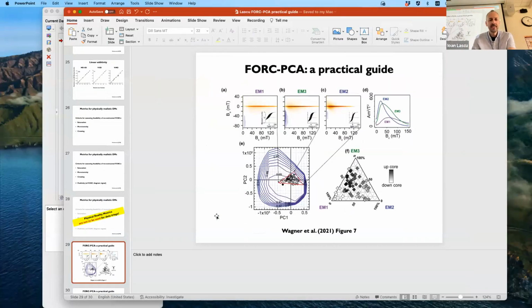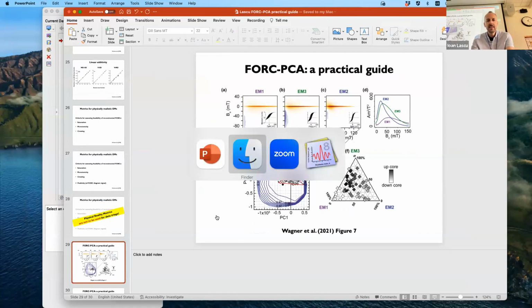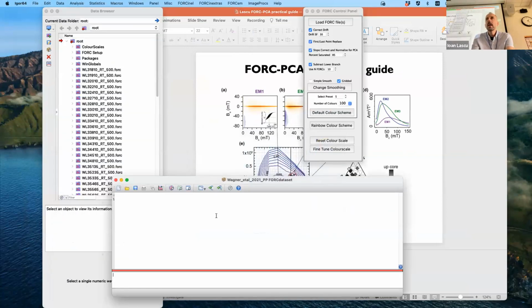So yeah, Max. I have a stupid question. What if you only have 2 contributions? 2 end members? Yes. You will basically hope that your PC1, so the first eigenvector, is controlling most of the variability in the data set. And then you don't need to go to, yeah.